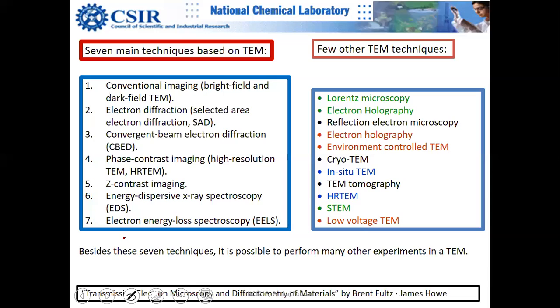When I say atom, I'm emphasizing the electron interaction, the interaction of the electrons which I'm bombarding onto the material I'm investigating.